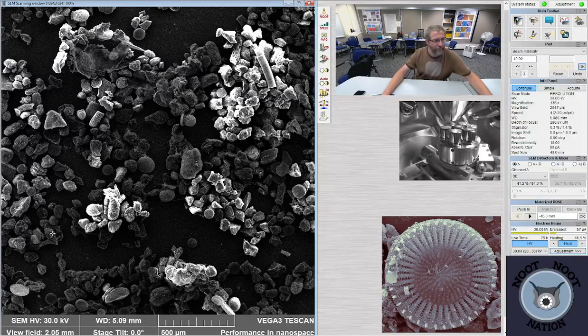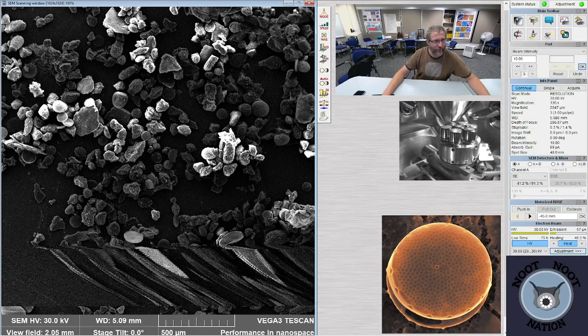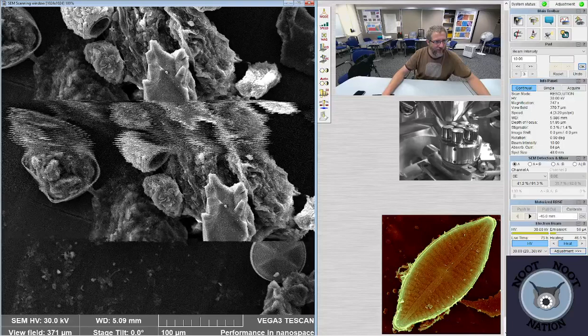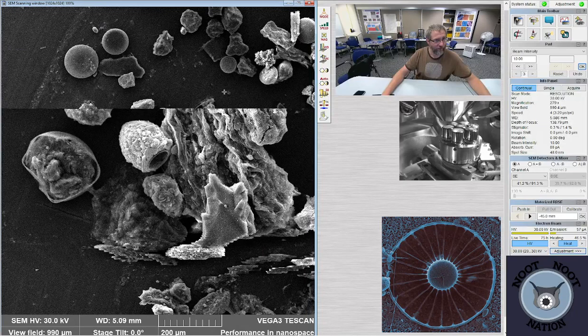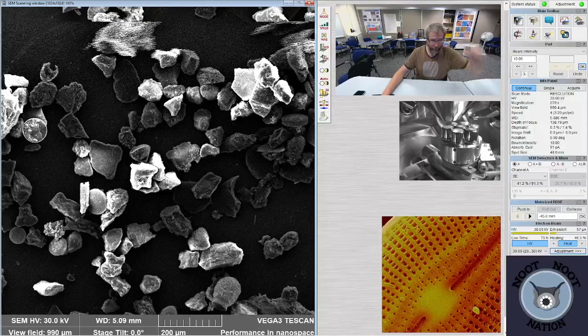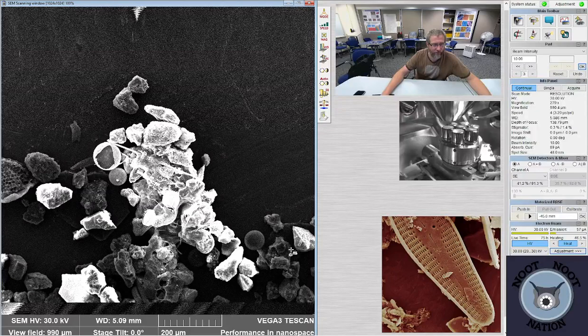I'm always hoping when I go through these samples that I find some dinoflagellates, where you could see the plates very easily, but we almost never see them. And I think it's because they just degrade pretty rapidly, or you can see the tintinids everywhere. Or they're here and they just shrivel up when they get in a vacuum. Like structurally, they're not stable enough to actually image without making some adjustments to them. I'm not sure which it is. It could just also be they're rare. Or get clumped up when we start looking at them in the SEM.